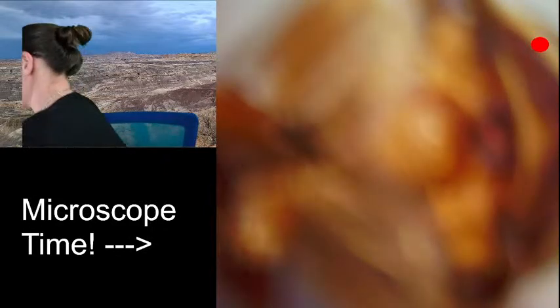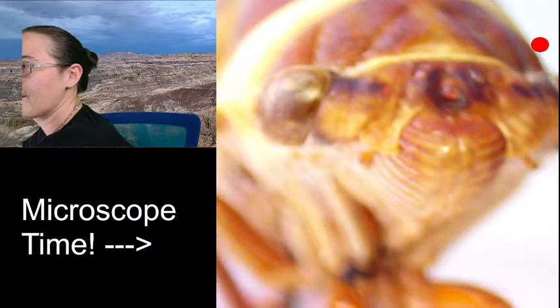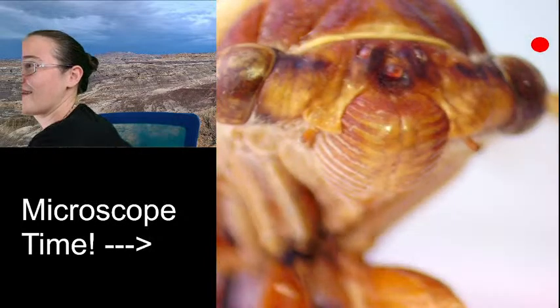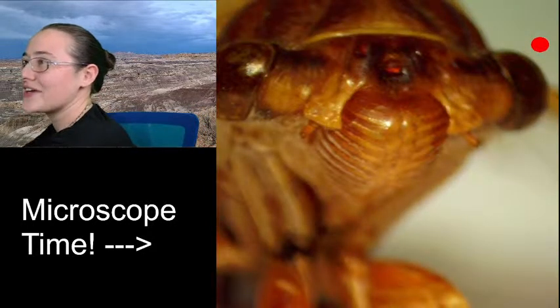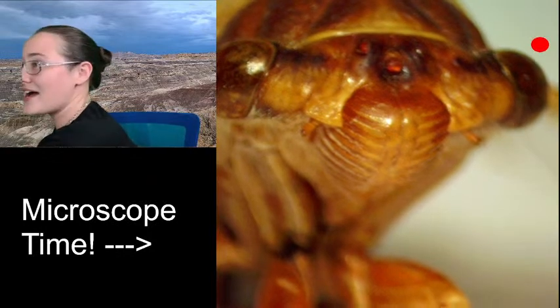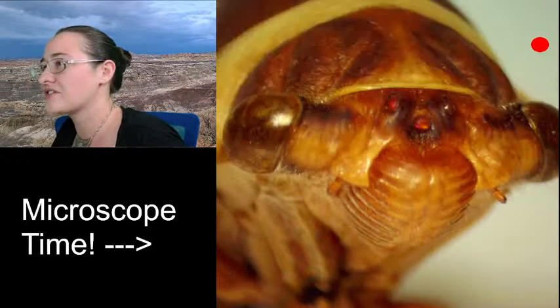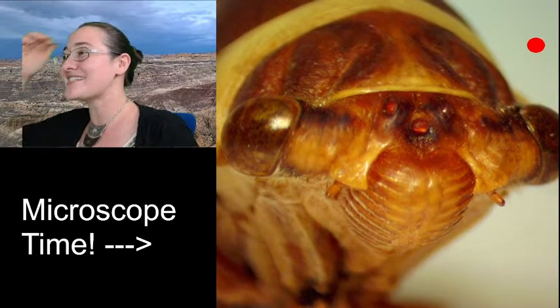And when we put this specimen on its side, it gets very close to the microscope. Let's see. Here we go. There we go. All right, so this is the cicada head-on, and I am holding it in place for the microscope. Let's see if I let it go, if it'll stay. Stay. All right, cool, it's listening.